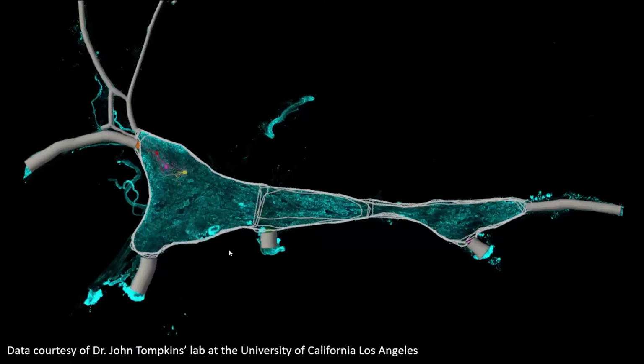In this example of a segmentation that allows morphological and physiological data to be registered to a generic organ scaffold using the detailed fiducial markings, it is not complete until these fiducial structures segmented in the stellate ganglion are named using FAIR ontologies from the SciCrunch database.